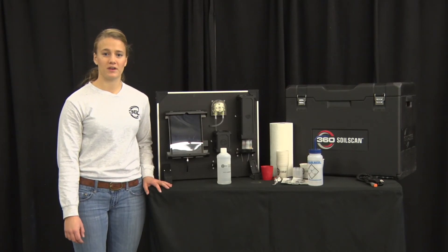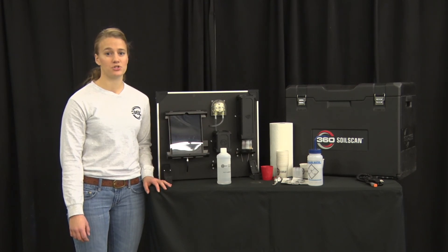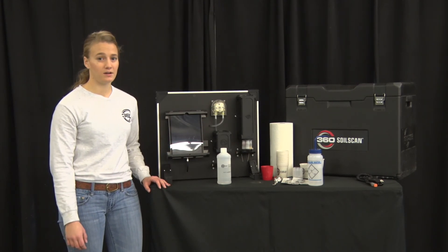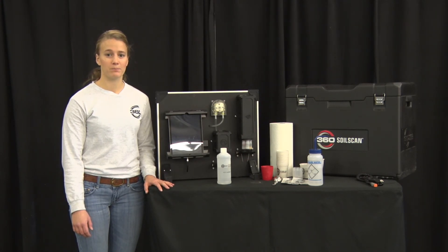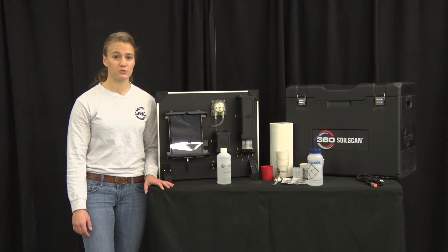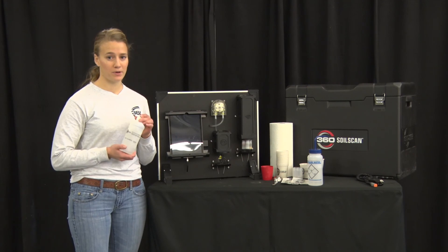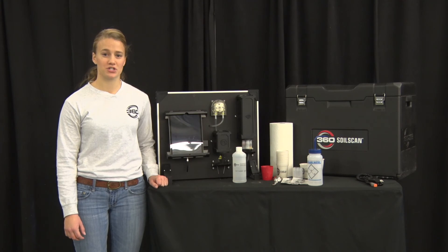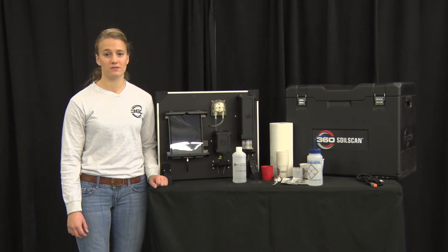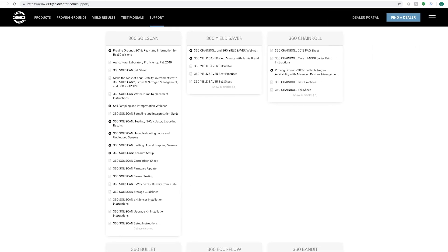When putting away your soil scan for long-term storage such as over the winter, ensure it's stored in a mild-temperature room — 60 to 80 degrees is preferred. Also ensure you remove all distilled water from the system and purge the pump; the pump can be stored dry. Store your nitrate solution — any unopened bottles — under the same conditions as your soil scan. By following these basic operation instructions and storage tips, you will get the best use out of your soil scan. For additional information such as pulling soil samples, refer to the support page at 360yieldcenter.com.